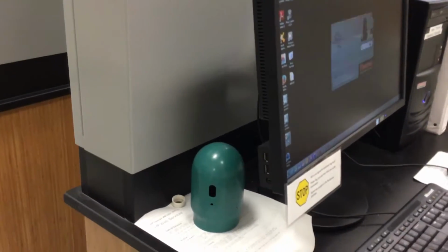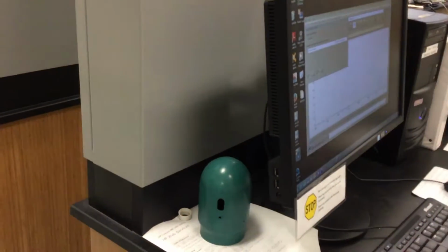and we don't want that confusing your spectrum. So we're going to subtract that out by collecting the background. The software is called Omnic. If the software wasn't open, you just double click on that Omnic software. So say you walk up, the computer, it's not up. Just double click on Omnic, boom, it pops up.